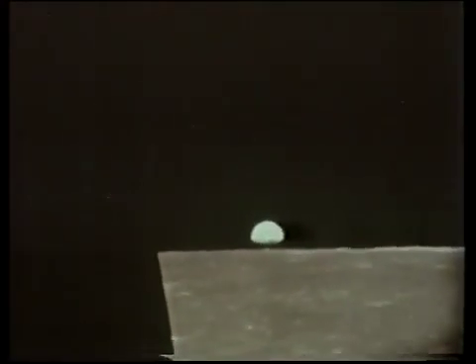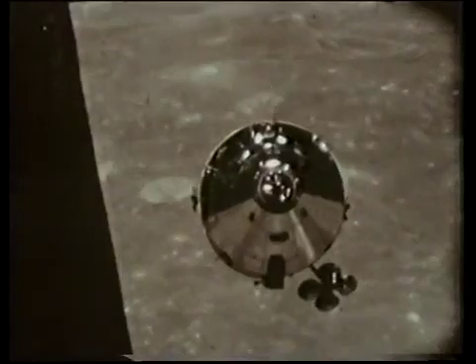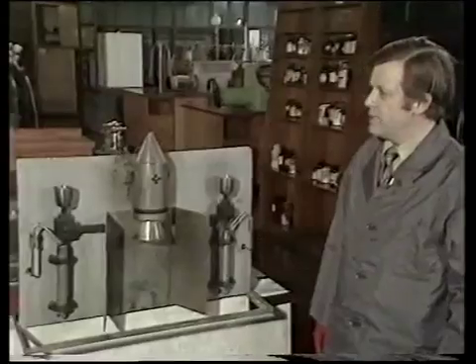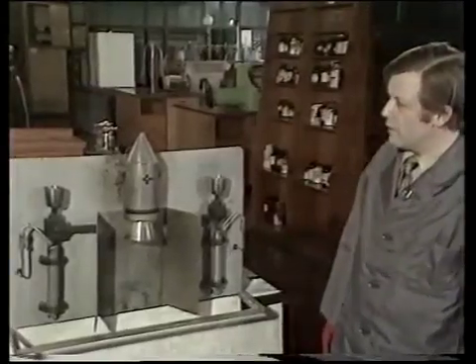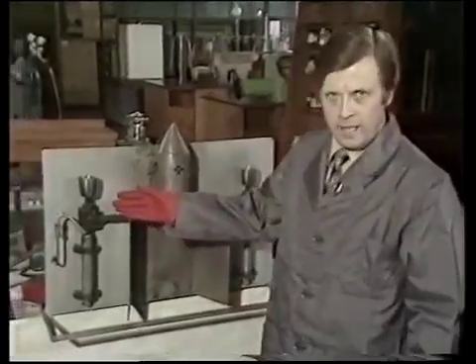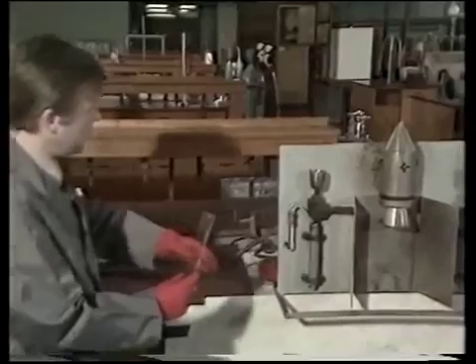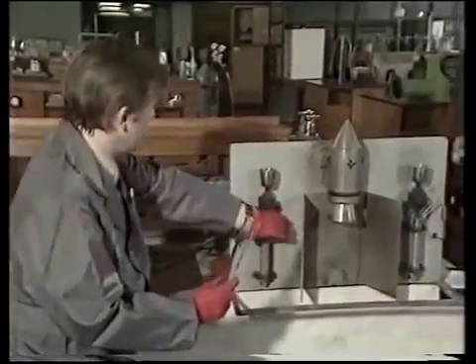Instead, unsymmetrical dimethyl hydrazine was used as the fuel in Apollo spacecraft, along with N2O4 as the oxidizer, and we can now demonstrate the burning of that particular fuel combination. It's necessary for us, first of all, therefore, to load the fuel tank. The hydrazine is the fuel, and here we have 30 milliliters of the fuel, which we'll now put into this tank.